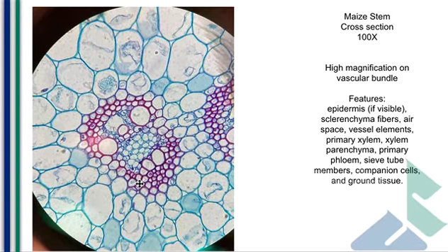These are not going to be used to transport water like this tissue, but instead are going to be used for support. So we do see those sclerenchymal fibers supporting our vascular bundle because this is a heavy structure. Water pipes, moving lots of things, dead tissue. It's going to have some weight on the plant. Again, we see the airspace, a region of dead cells, allowing these tissues to breathe.